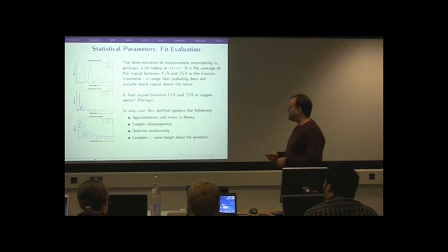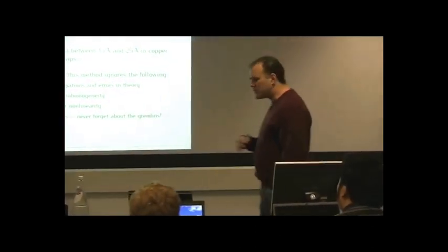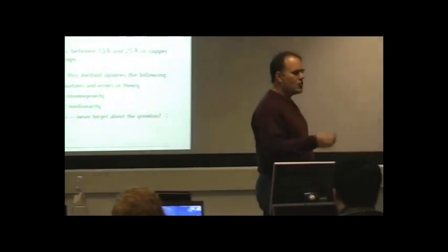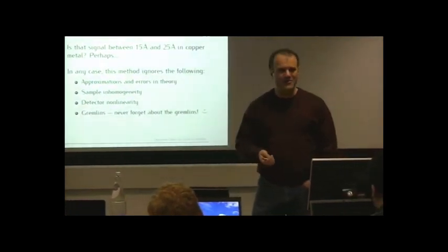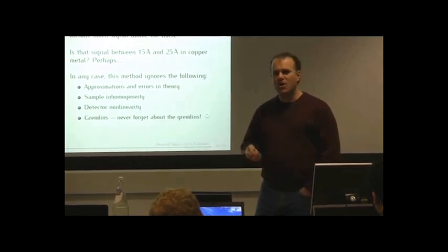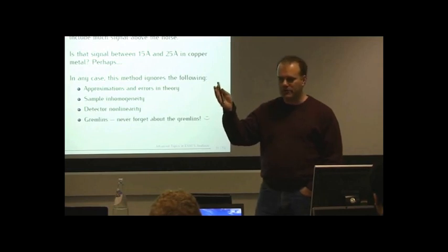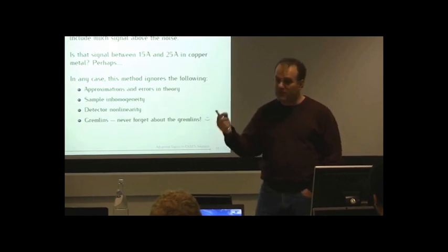But this is just a measure of the statistical noise, the shot noise. And that's just never the limiting problem in an XAFS experiment, right? Because what I mean by shot noise is noise on your detectors. And say, take I0 as the most extreme example. The level of noise on I0 is really, really low, because at even a really bad beamline like my beamline, we're still putting 10 to the 9 or 10 to the 10, on a good day I suppose, photons into I0. There's a lot of photons in I0. The level of noise on I0 is really, really low.